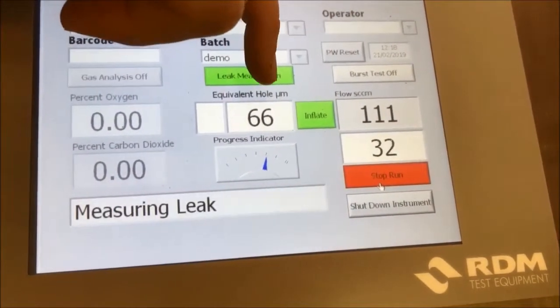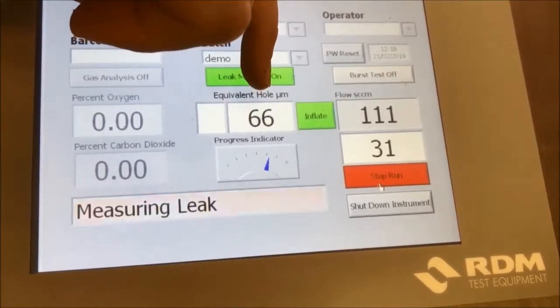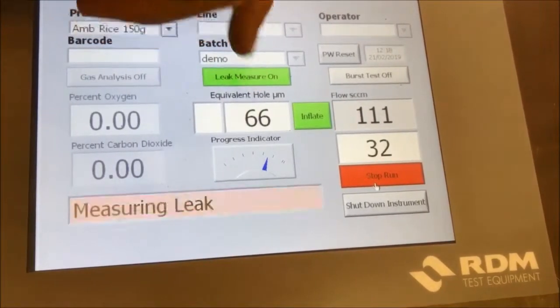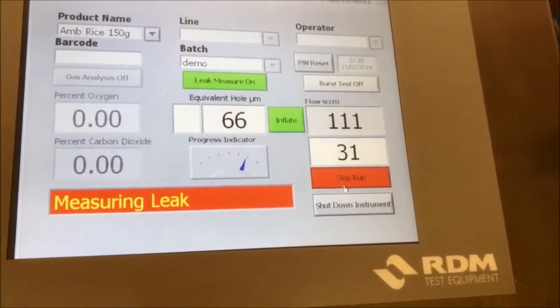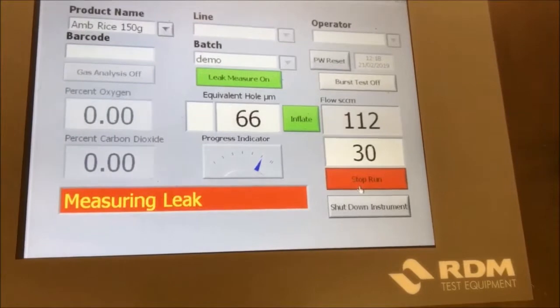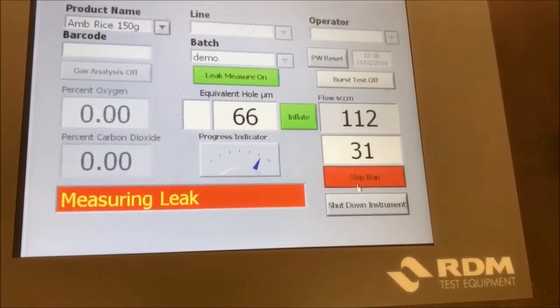Quite clearly, it's very easy to identify a leaky pack, whether it's a pinhole or whether it's a channel leak. As I said, this is the Checker Pack 200 instrument.